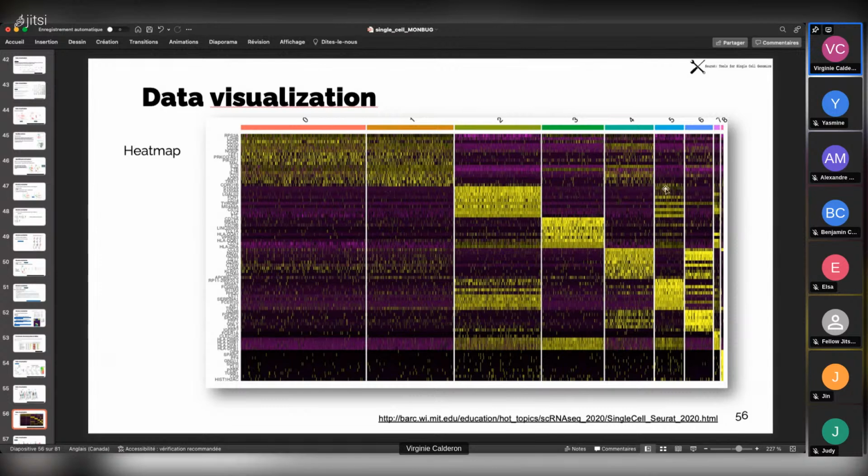And if I look at other clusters, I see that there are specific markers for each one here. We have like a scale, so I will keep these separated. That's also interesting. You can draw a heat map based on markers, top 10, top 20. You can draw a heat map based on a list from the researcher. Whatever way you have to look at this, you can look at a heat map for the mitochondrial RNA, or the cell cycle genes. You just choose the list of genes you want to represent here.